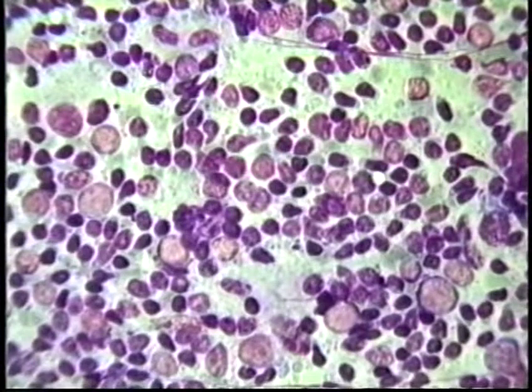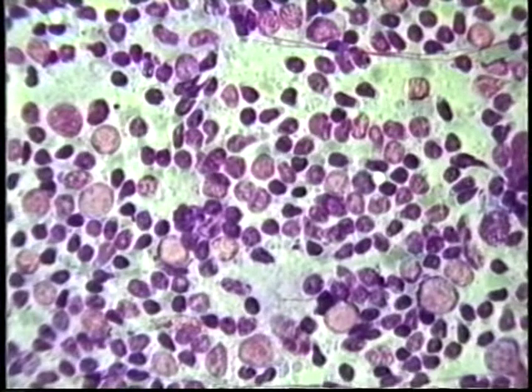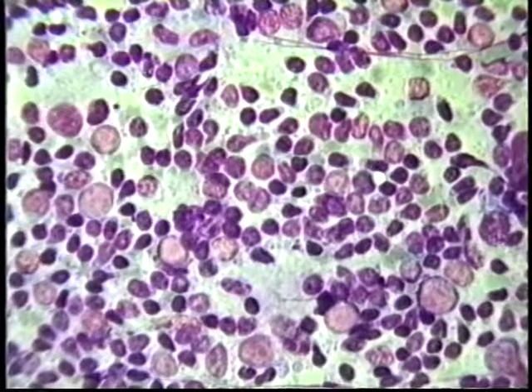After staining, the microscopic appearance is that of well-preserved cells, including cytoplasm on most cells, and presence of both clusters and single cells from most lesions. A common problem is the use of too much pressure during smearing. This will result in excessive numbers of crushed nuclei and few, if any, cells with preserved cytoplasm.